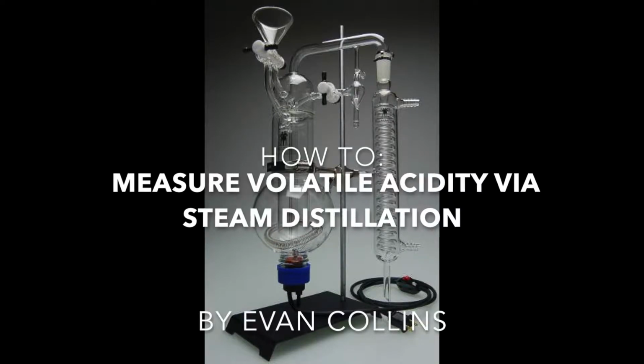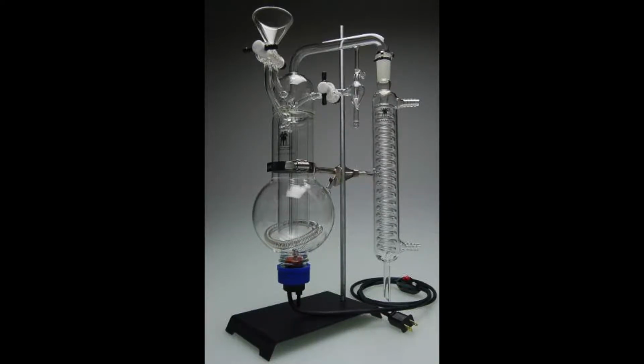Hello, my name is Evan Collins, and I'll be walking you through how to measure VA by steam distillation.